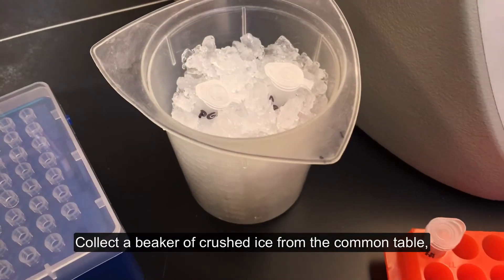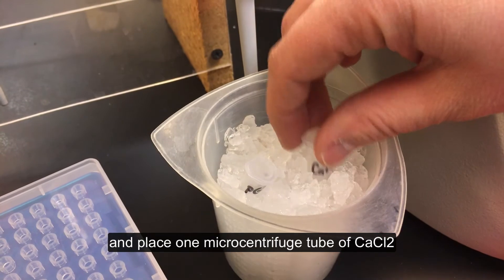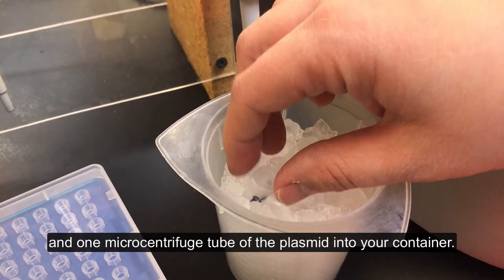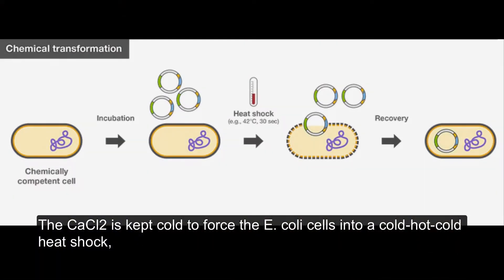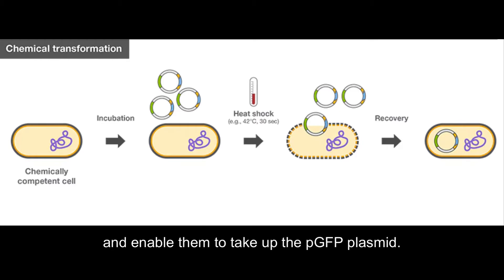Collect a beaker of crushed ice from the common table and place one microcentrifuge tube of calcium chloride and one microcentrifuge tube of the plasmid into your container. It is important to keep the PGFP cold to keep the plasmid from denaturing. The calcium chloride is kept cold to force the E. coli cells into a cold-hot-cold heat shock, which in the presence of the calcium chloride will make the cells more permeable and enable them to take up the PGFP plasmid.